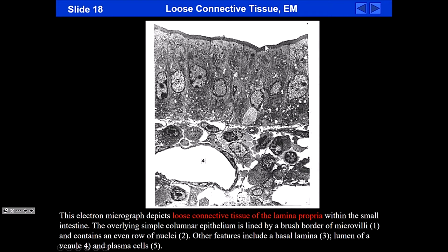Here you can see the microvilli, very prominent brush border. At low power, it looks kind of uniform because they're very densely packed. At the bottom is going to be the basement membrane right there. You really can't make it out clearly, but it has to be there because you can see that the lamina propria cells now have taken on a different appearance to these simple columnar cells.